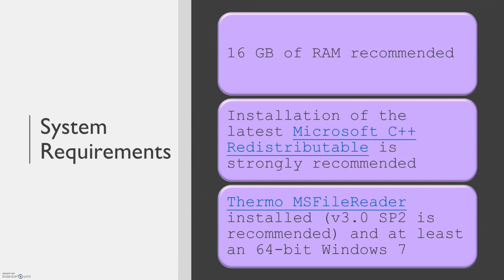Let's begin. First, we're going to discuss system requirements for the use of MetaMorpheus. We recommend that you have 16 gigabytes of RAM. Second, installation of the latest Microsoft C++ redistributable is strongly recommended. And finally, if you plan to use .raw Thermo files, we require you to have the Thermo MSFileReader installed on your computer. We recommend version 3.0 SP2.